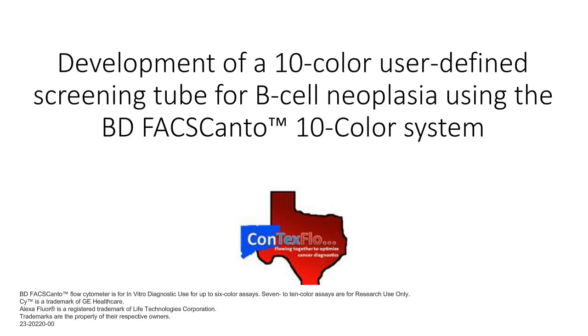Okay. And there are lots of ways to skin the cat. We generally have good luck doing a pre-lysis. So we do our red cell lysis and then 2 washes, and then do our surface staining. Okay. And Dr. Chen or Dr. Fuda, would you guys like to add anything? Sure. Yeah.